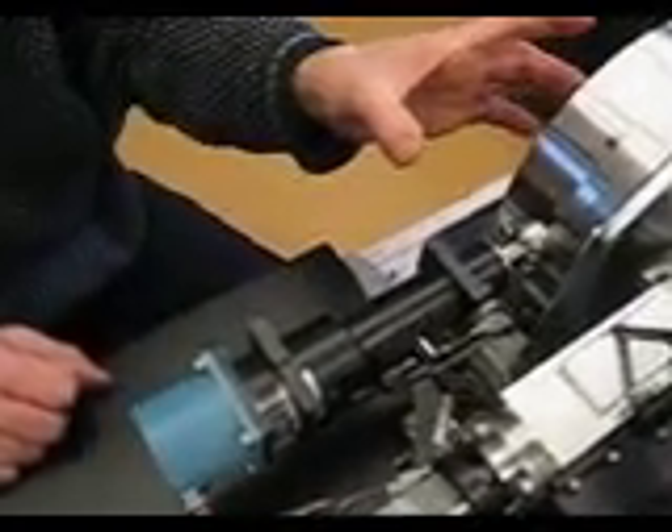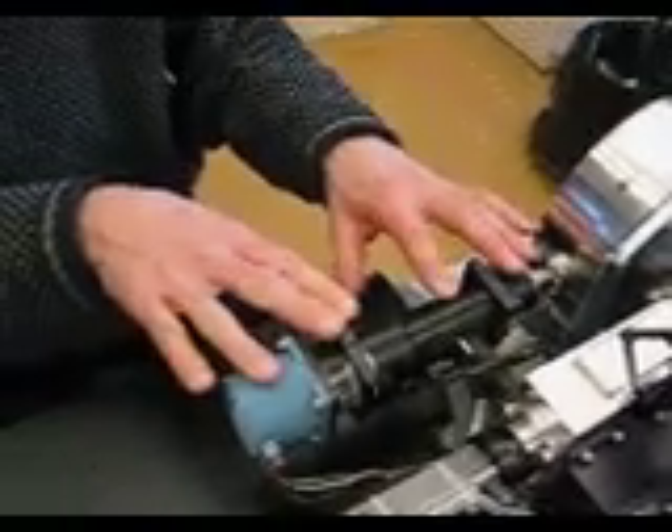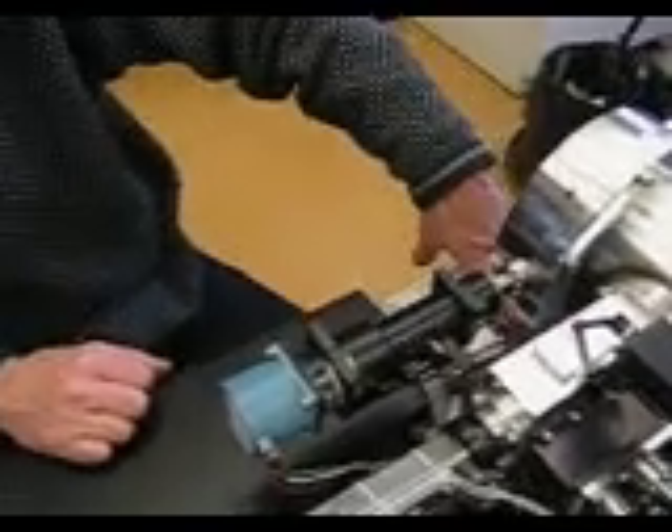We don't move the laser beam, instead we move the plate. And there's another one of these assemblies that's located underneath the manifold to allow for motion in the y-dimension.